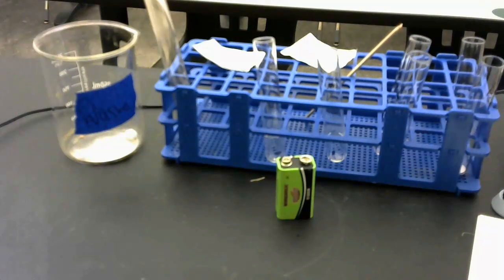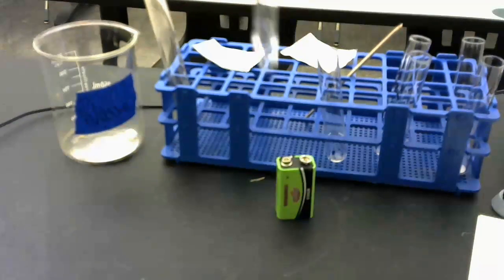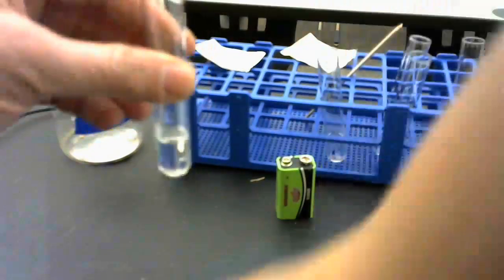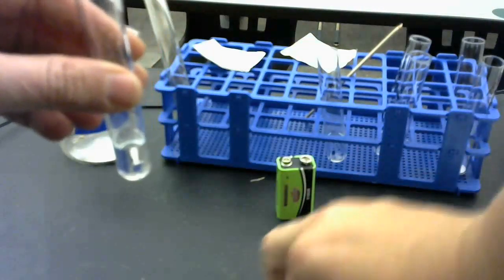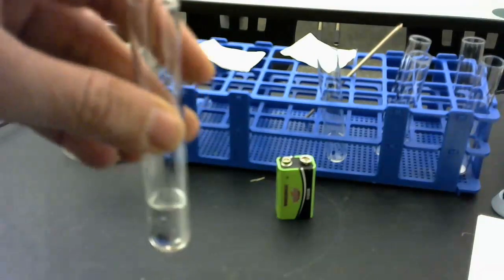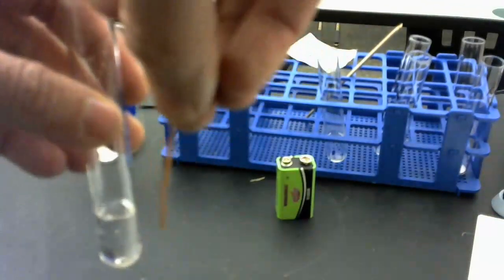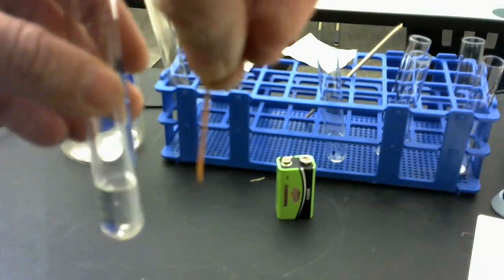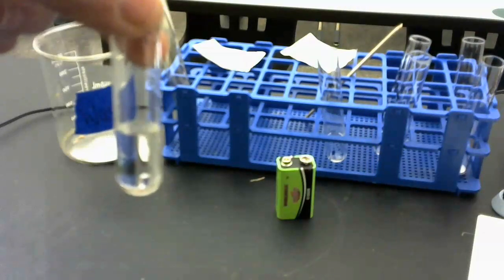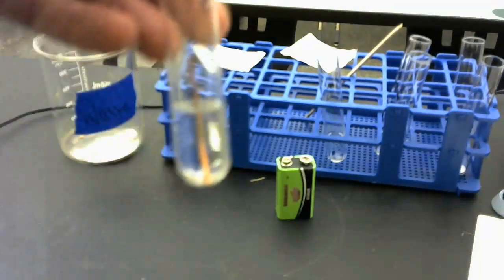Reaction type C number 1 says, place a strip of copper in a test tube with enough AgNO3 to cover it, okay? So what I've already done is I've already set out the AgNO3 for you. So here's your AgNO3, and then I've also set out your copper. Now my copper strip is going to be longer than my AgNO3, but I'm going to go ahead and just drop this in. So my copper is definitely a copper color, what we would call copper, and then we have a clear solution here of AgNO3, and I'm going to drop that in there.